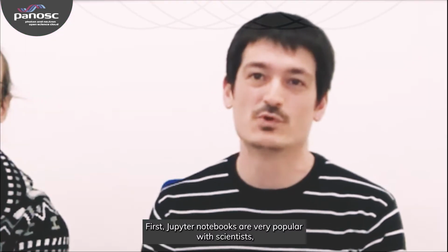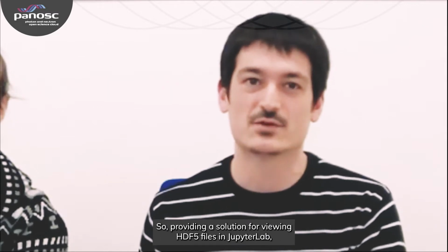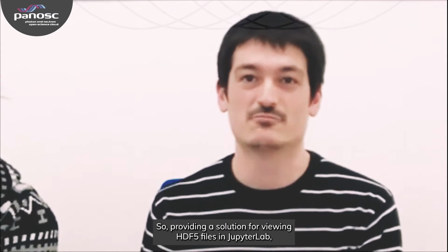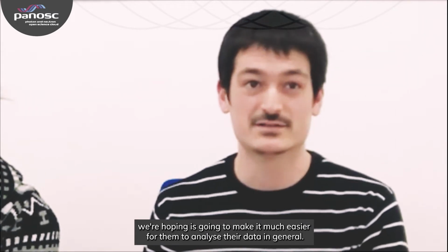First, Jupyter notebooks are very popular with scientists, and not only in the photon and neutron community. So by providing a solution for viewing HDF5 files in JupyterLab, we're hoping it is going to make it much easier for them to analyze their data in general.